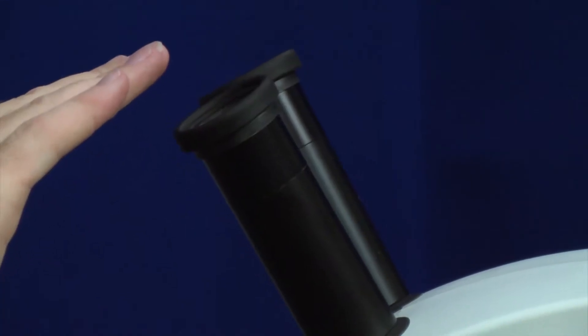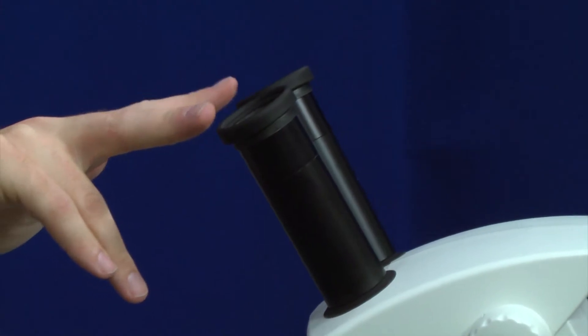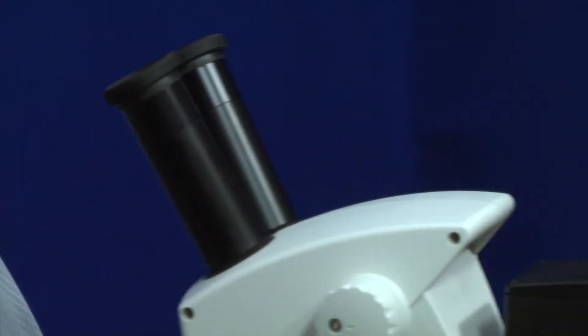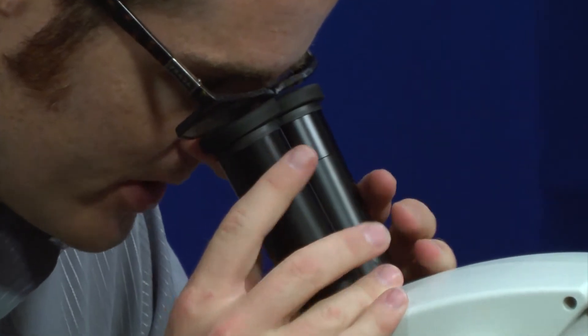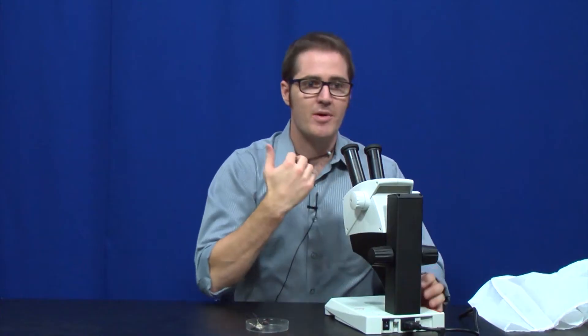These are what we call high eye point eyepieces. What that means is the focus point is actually right about here on the microscope. Older microscopes, you might remember having to put your eyes right down next to the lenses to see things. In this case, we actually want our eyes a little bit further away. This was designed for people like myself who wear eyeglasses. So when I actually look through the microscope, I'm going to put my glasses right on the eyepieces, and that's going to put my eyeballs in exactly the right place to focus and see a nice clean image.